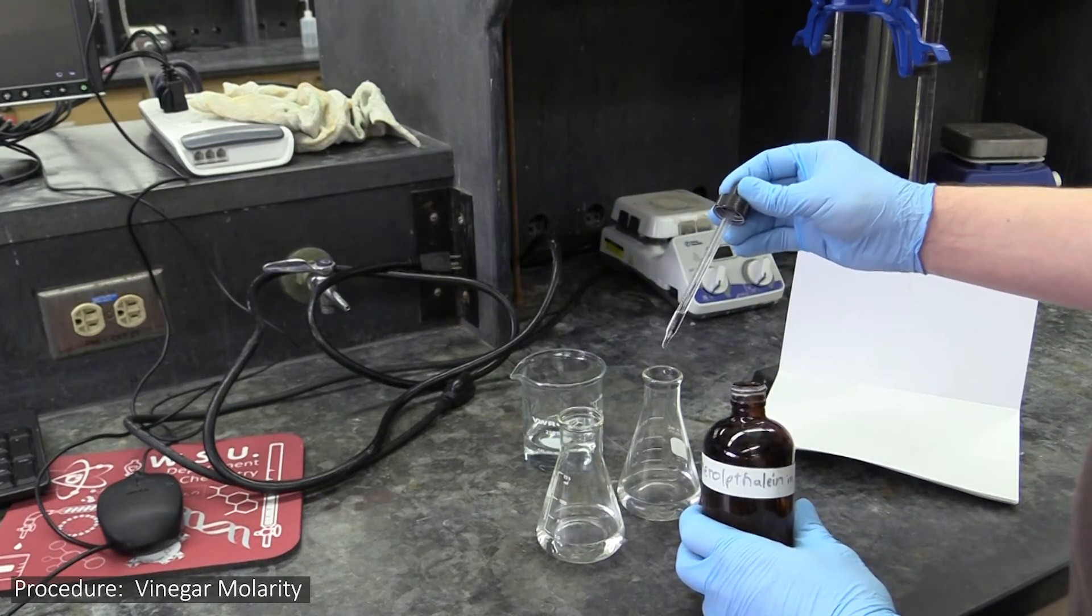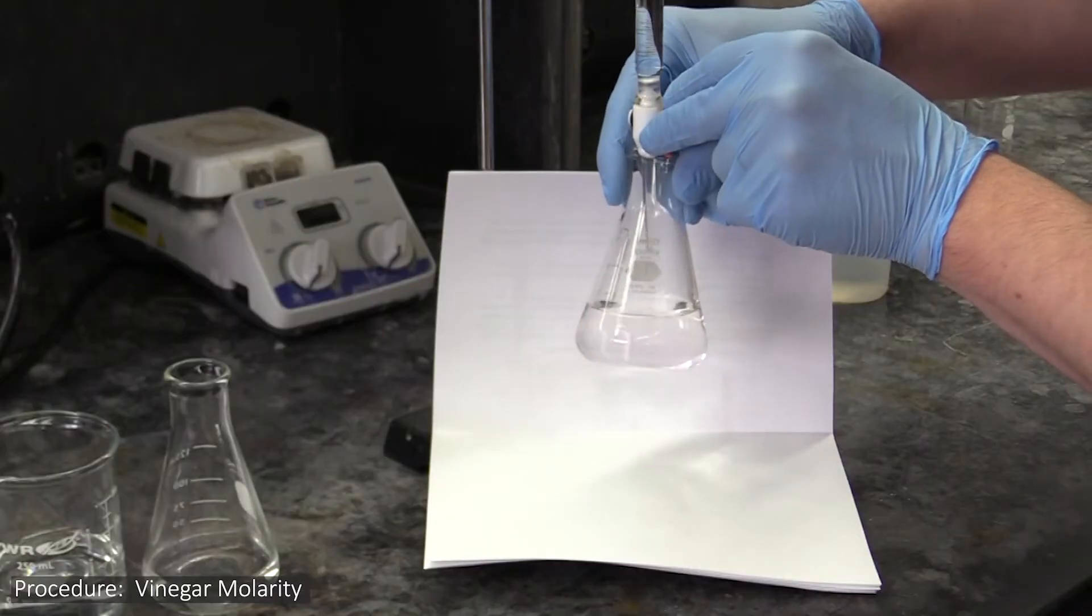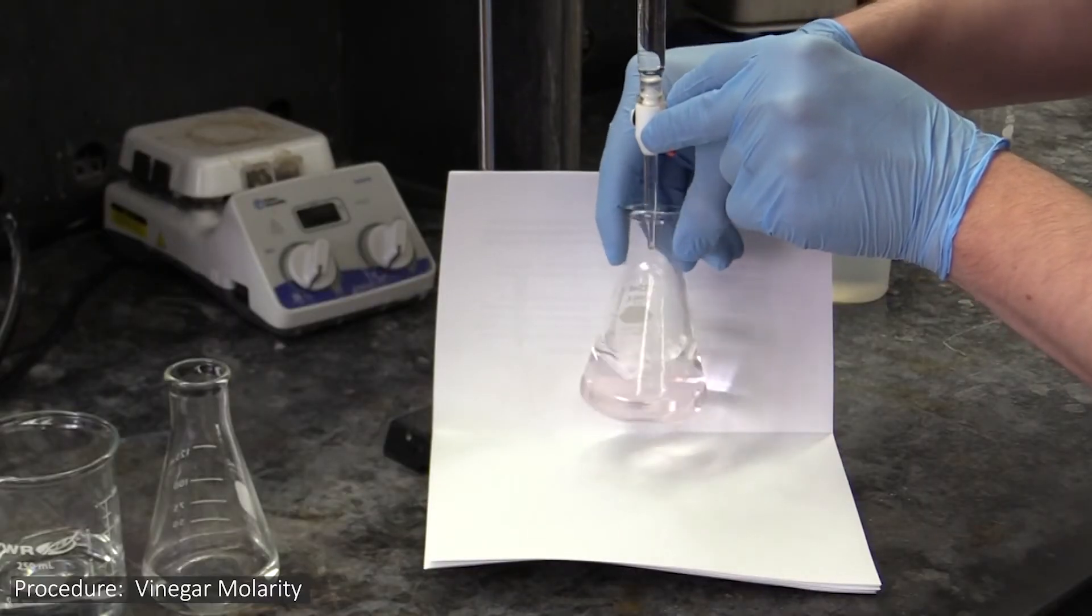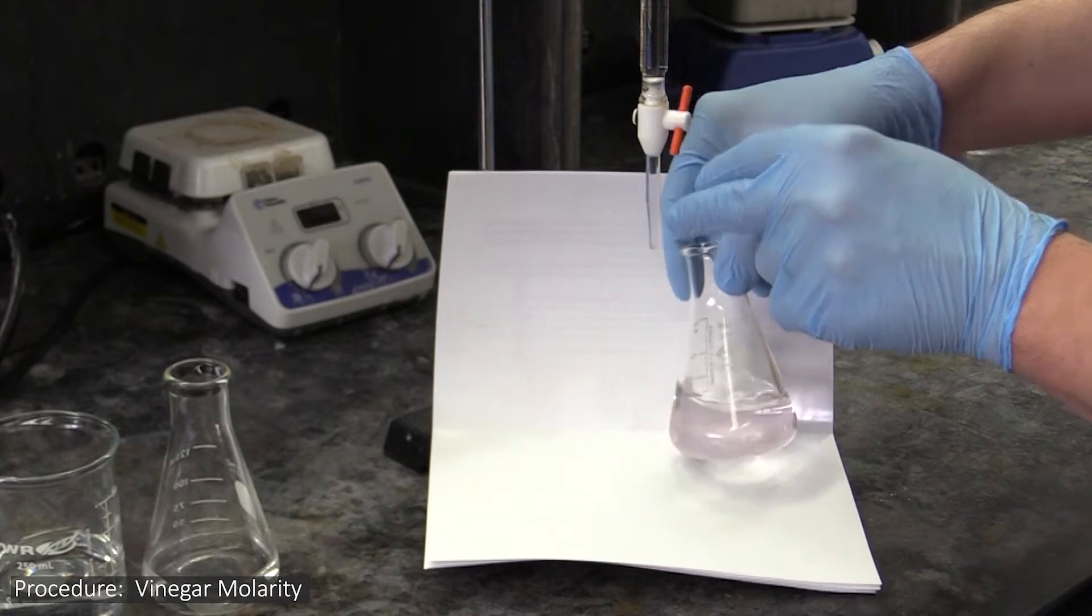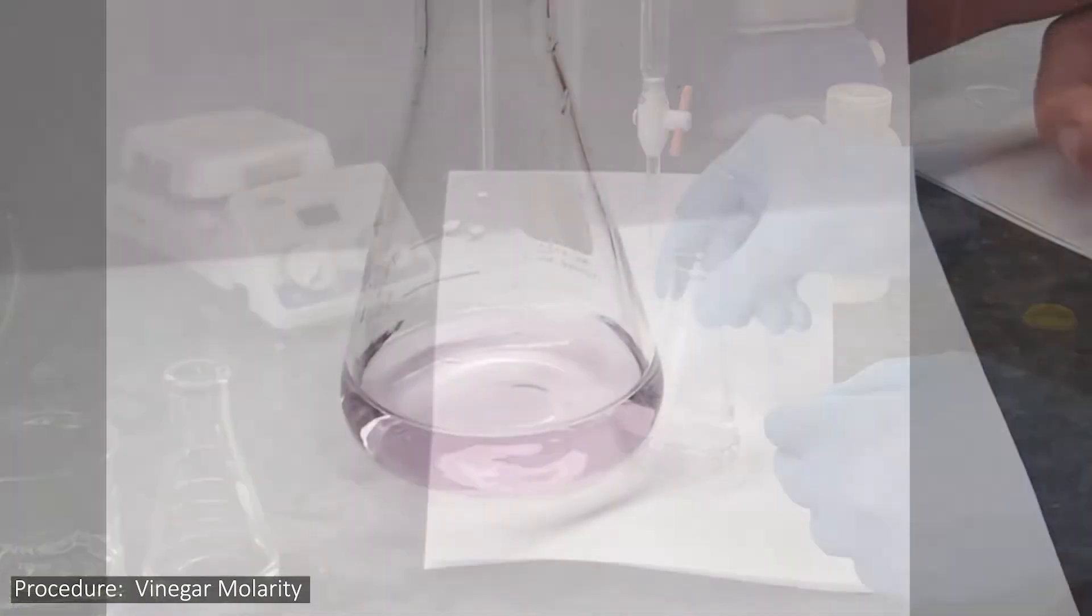This indicator will tell you when your titration is finished. As soon as you have added enough sodium hydroxide to react with all the acetic acid present, it will make the solution turn from clear to a pinkish-magenta color.